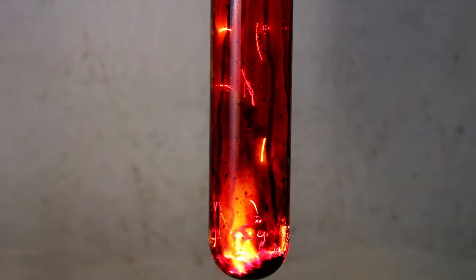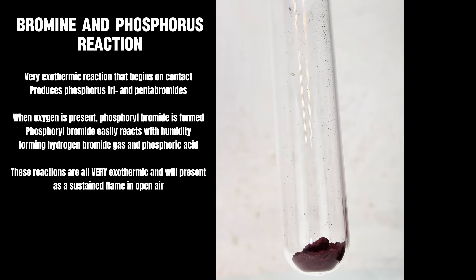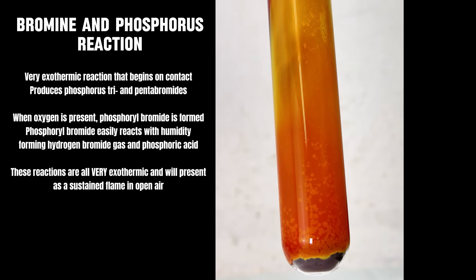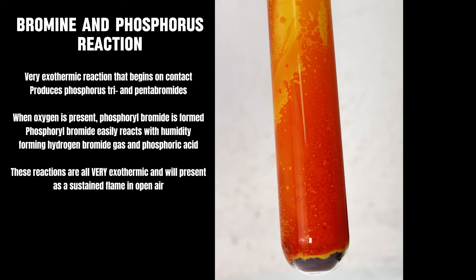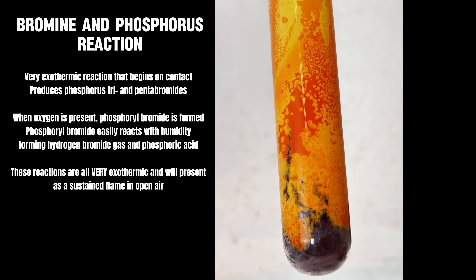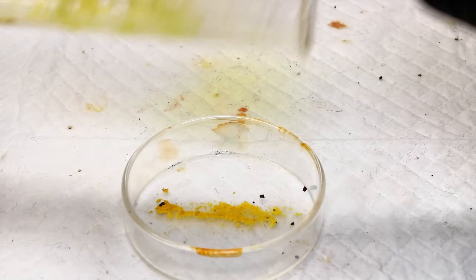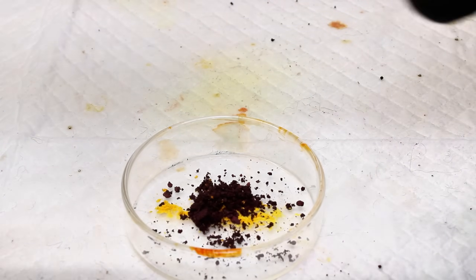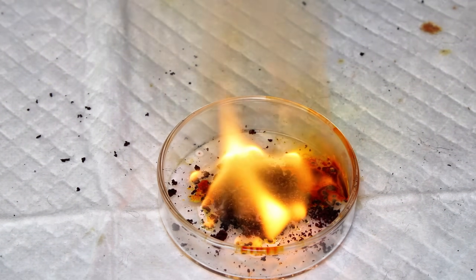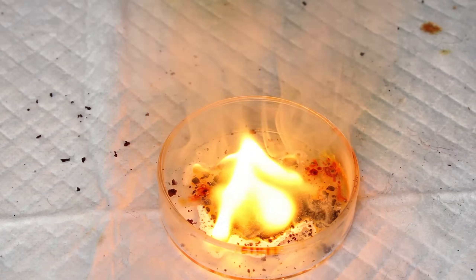Bromine will also react with different nonmetals, most famously in its reaction with red phosphorus. When bromine comes in contact with red phosphorus in a test tube, there's a brief flame followed by the entire inside of the tube turning first orange and then yellow. This yellow substance is phosphorus pentabromide, which is like a less useful version of phosphorus pentachloride—I could make a video on that if there's any interest. Given that these two react in a 5-to-1 ratio, there's quite a bit of unreacted phosphorus that I then scoop out of the tube along with the yellow phosphorus pentabromide. When bromine reacts with phosphorus in open air, it simply ignites and will burn for quite a while, but the vapors can't be the safest, so I went ahead and put it out.